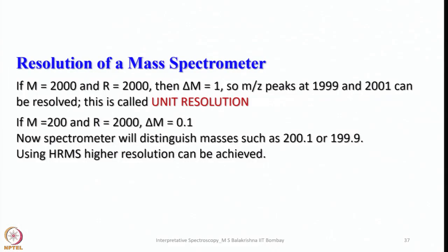In my last lecture, I started discussion on topics such as mass spectrometry. When I concluded my last lecture, I was talking about resolution in mass spectrometry. So let me continue from where I had stopped. So, resolution of a mass spectrometer.